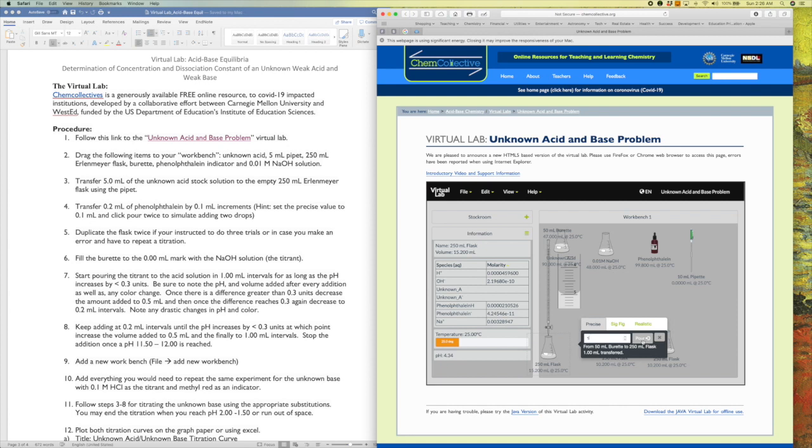And we're going to do it again. And that was again, right? The increment by which it's going up is decreasing. So now it's increasing in increments of about 0.07. So very small, right? Which is what we want. And notice that so far we've added 7 ml, and there's 7 more ml in the flask. And I'm going to pour more.